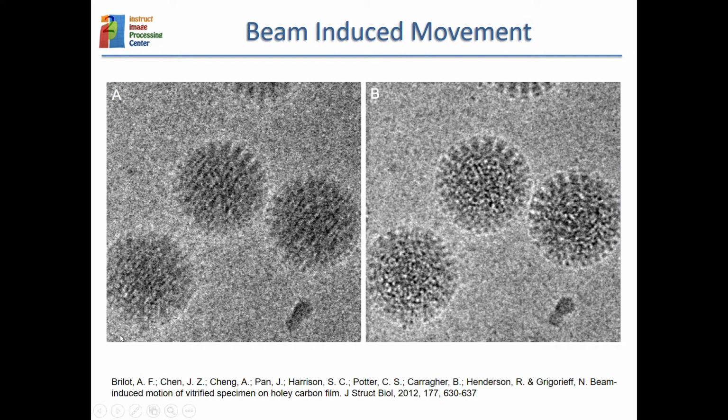So if you average all those movements, let's say that you take a picture with an exposure time of 1 second, within this 1 second you are averaging all the movement of the sample. So at the end, what we were having was a blurred version of the specimen image.